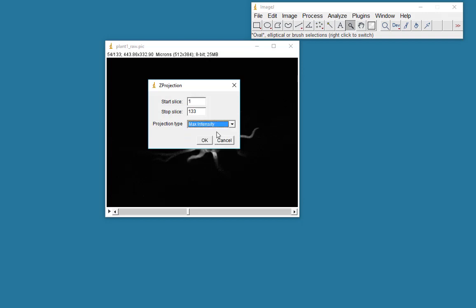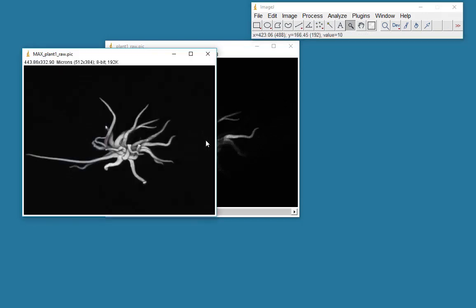So this will make a new image. And every location, every X, Y pixel location will be given the intensity value, the highest maximum intensity value that was present down that column of pixels in the original data set. So click OK. Here's our image.